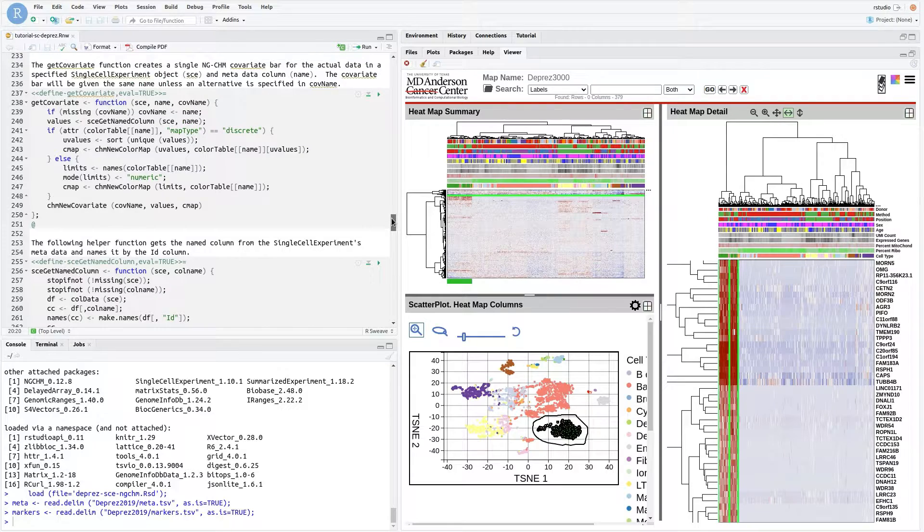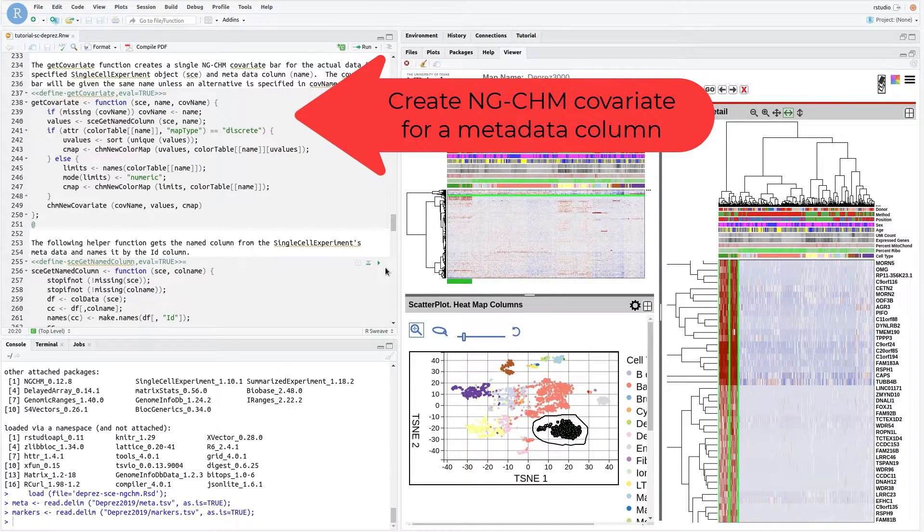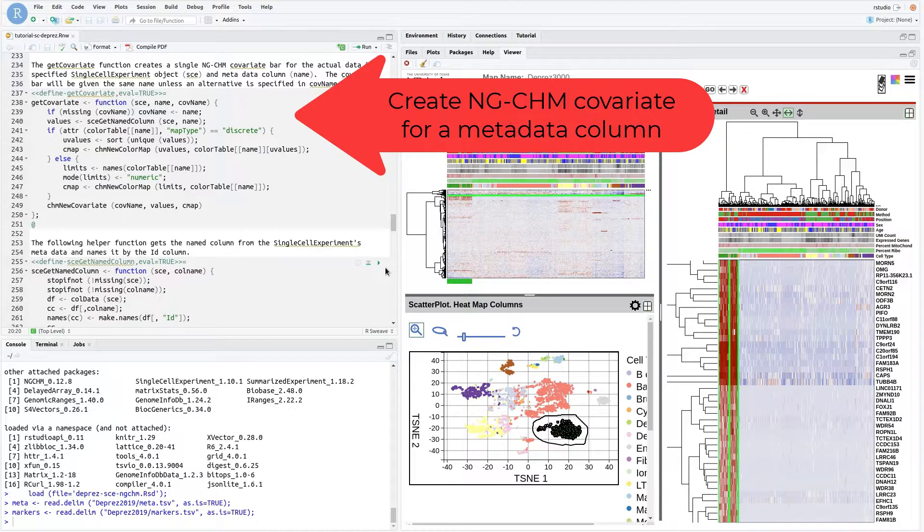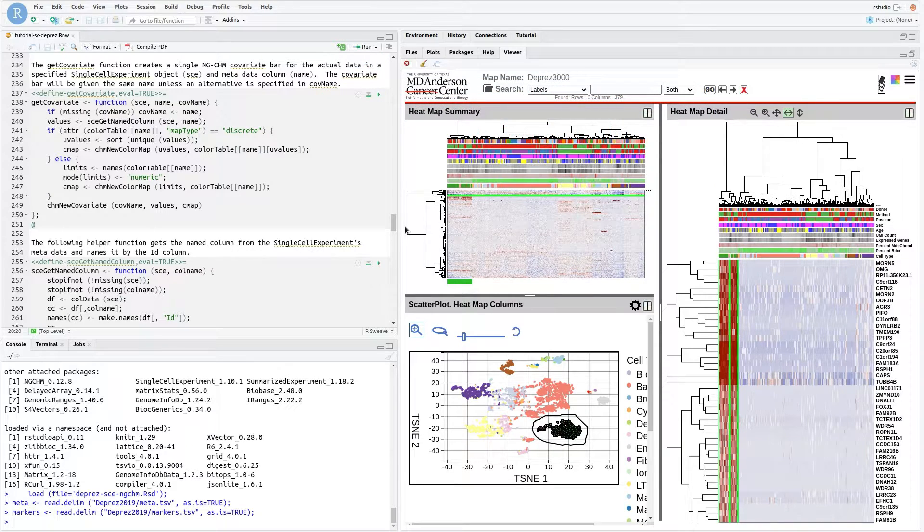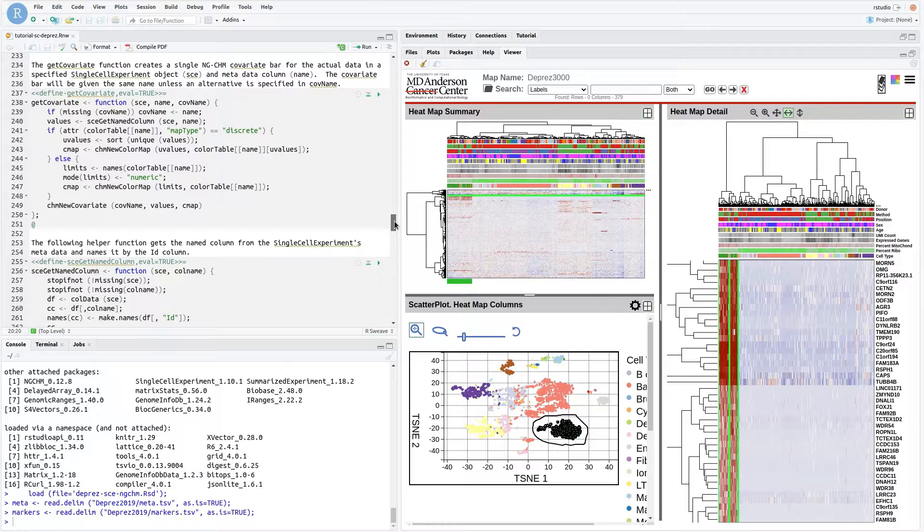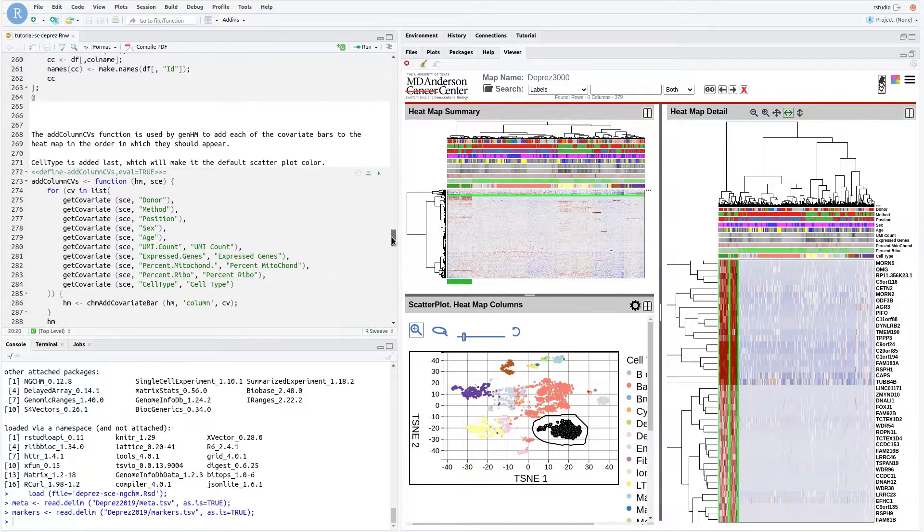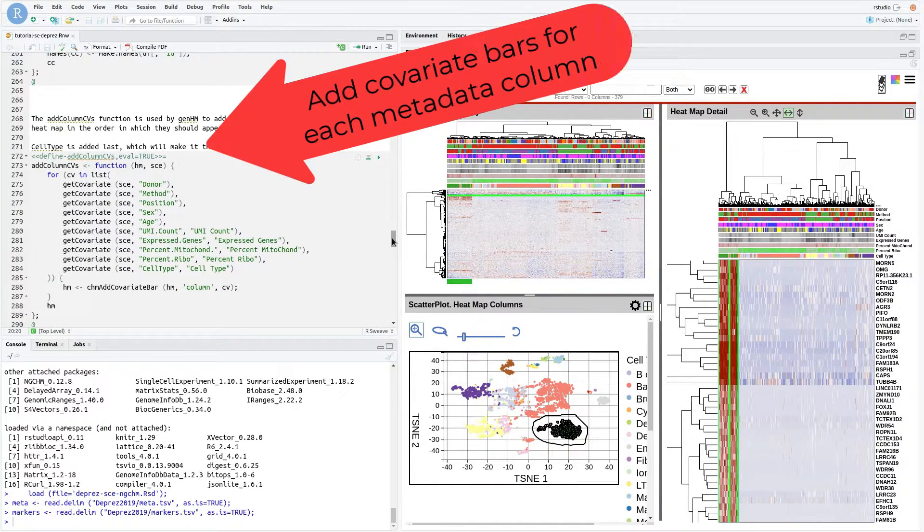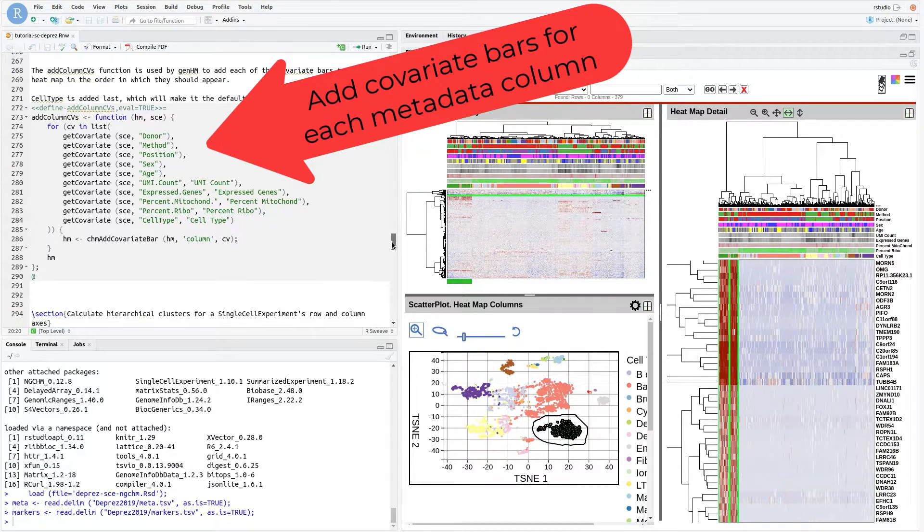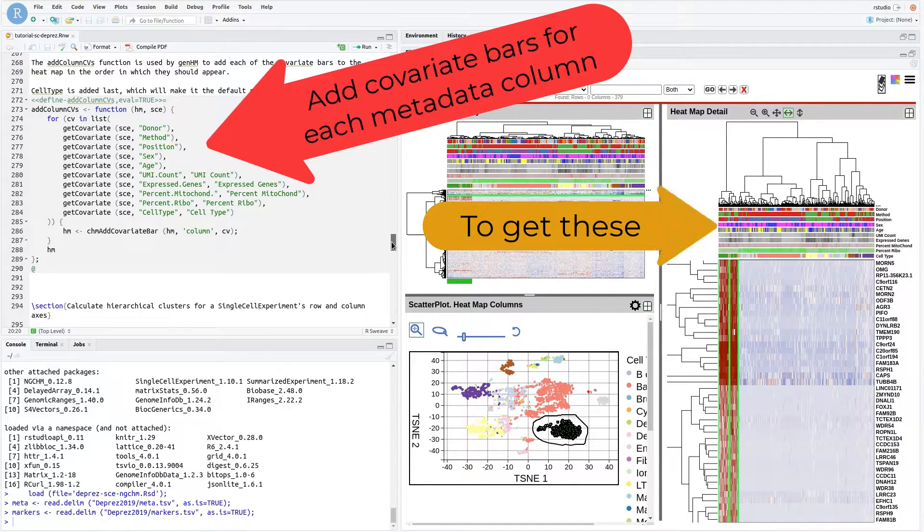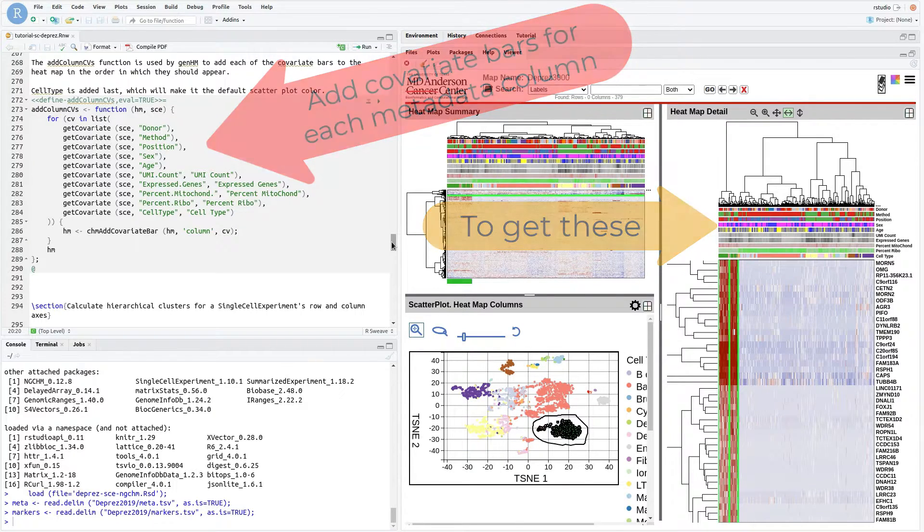The function GetCovariate creates an NGCHM covariate for the specified metadata column. Discrete and continuous covariates are processed slightly differently. Care is taken to remove any discrete values that by chance aren't included in a random subset of the cells. The function AddColumnCVs is used by the GenHM function to add the metadata columns to the heatmap. The covariates are added to the NGCHM in the desired order.